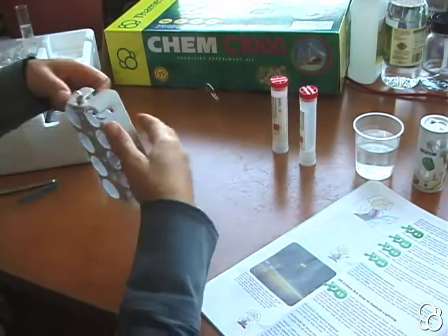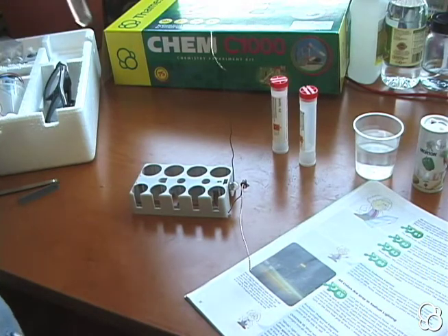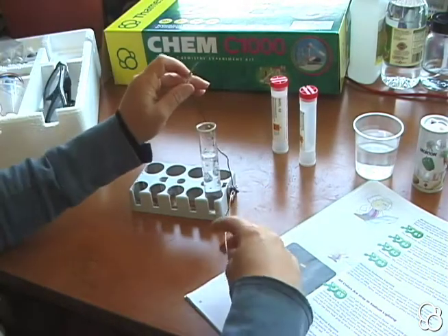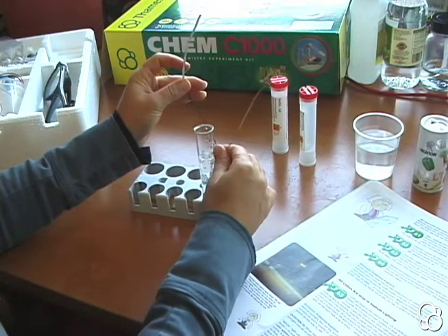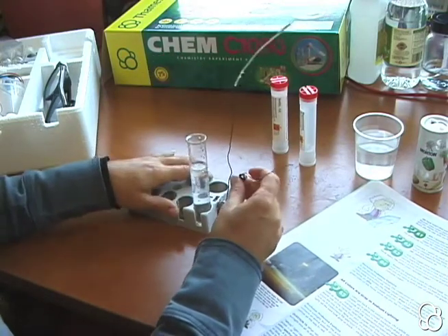Once you have that, you can put the test tube with the solution back in. You're going to put both the magnesium strip and the copper wire inside the test tube, but you don't want them to touch each other.